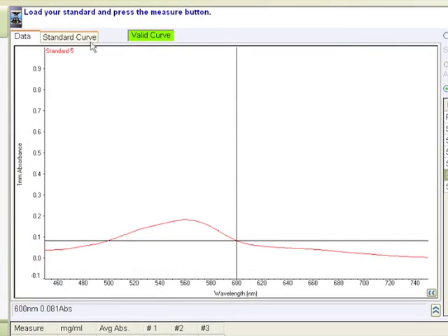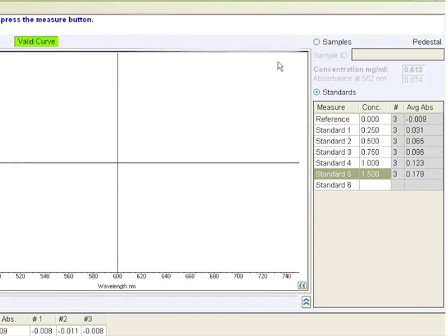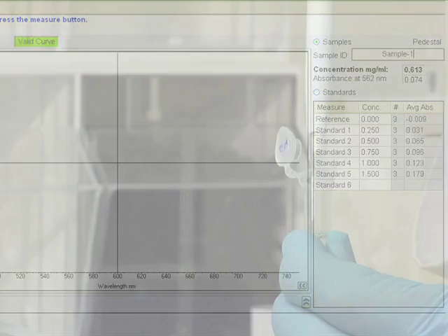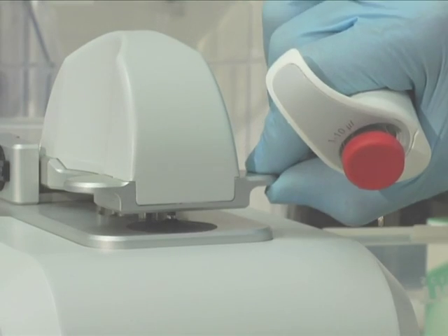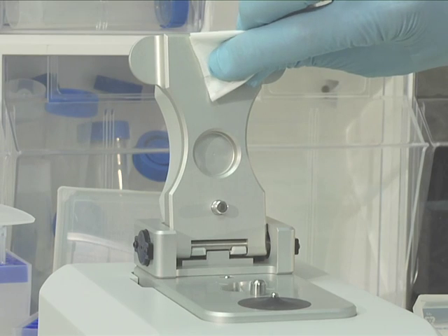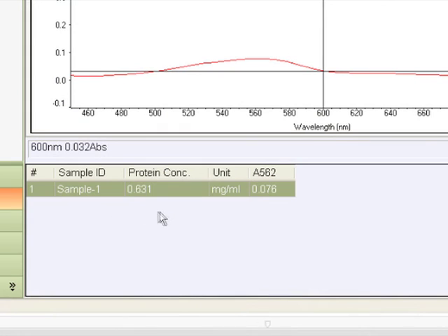To view the standard curve, click view standard curve. After all the standards have been measured, click on the samples button. Enter the sample ID, load 2 µL of sample onto the lower pedestal, and click measure. A fresh 2 µL aliquot of sample should be used for each measurement. When measurement is complete, wipe the sample from the lower and upper pedestals using a dry laboratory wipe. The result is then obtained as the final concentration of the sample is automatically calculated using the standard curve.